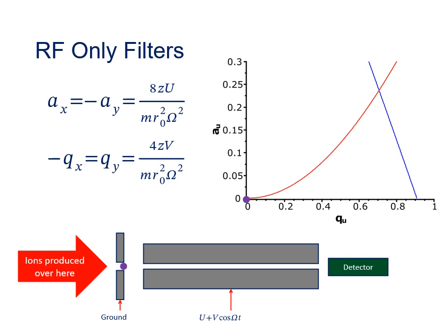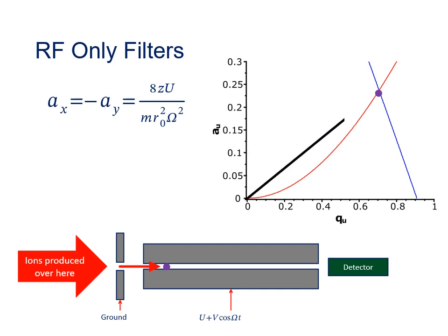So as this ion crosses the space between the ground plate and the quadrupole, it will see both the DC offset and the RF amplitude grow linearly. But now, if we look at what that means in terms of the stability diagram, see how the ion has to traverse all this unstable region before it sees the full voltages of the quadrupole, where it will plot inside the stable region at the tip. In fact, the ion doesn't see the full quadrupole fields until it's several times the quadrupole radius inside the quadrupole. And up until that point, all the way from the ground plate to that distance inside the quadrupole, it's in an unstable part of the quadrupole stability diagram.